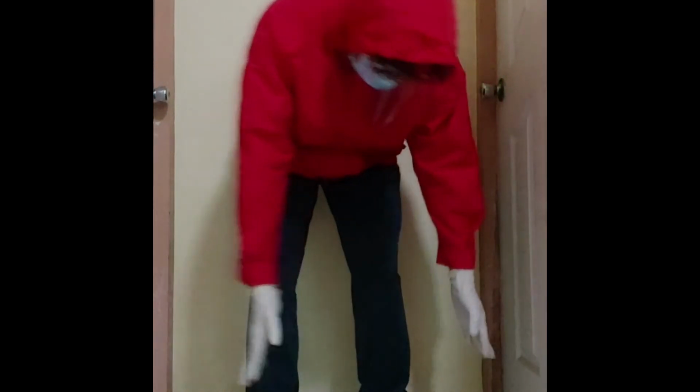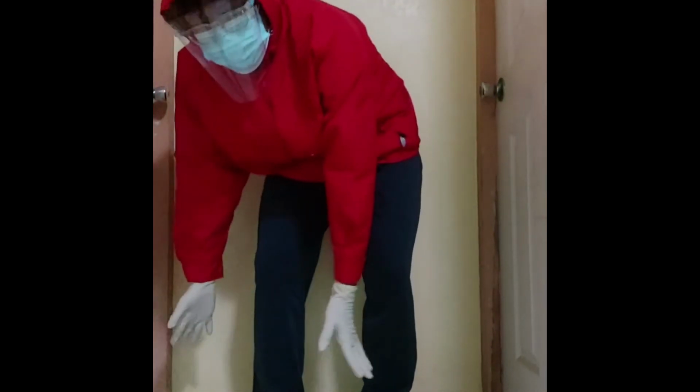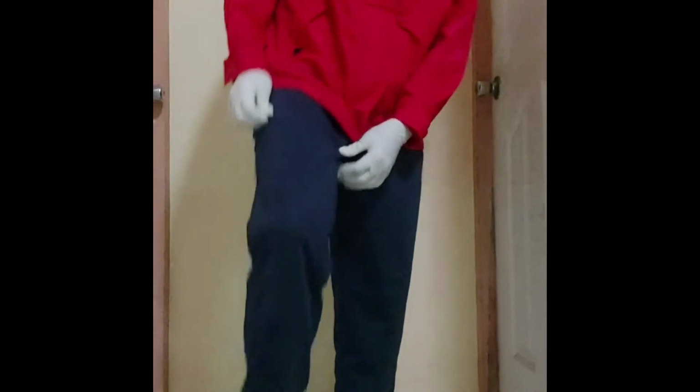Similar to the jacket, these pants are waterproof, so it protects the handler from potential splashes and possible microbial growth or contamination. However, the pockets in the pants could potentially be contaminated, especially if it is made of a different material that is not waterproof. Additionally, potential contamination could occur near the waist, in the area where the pants transition into the jacket.